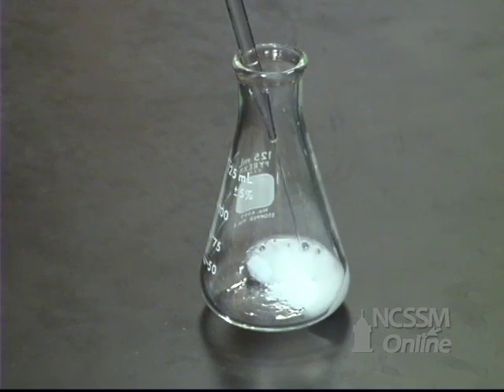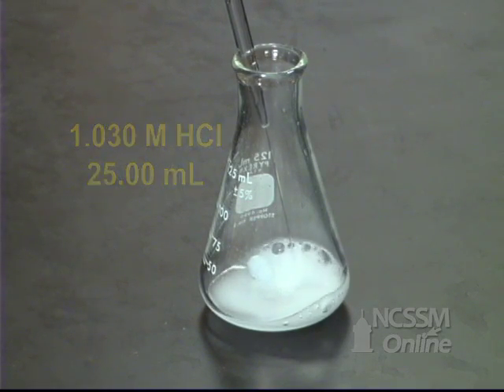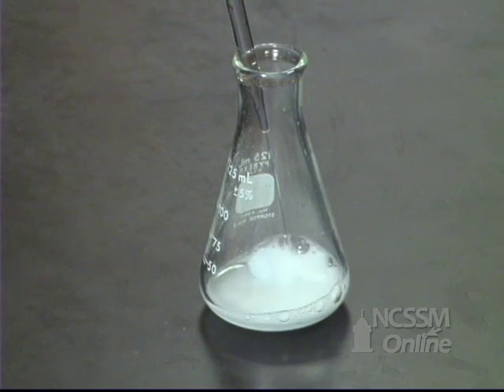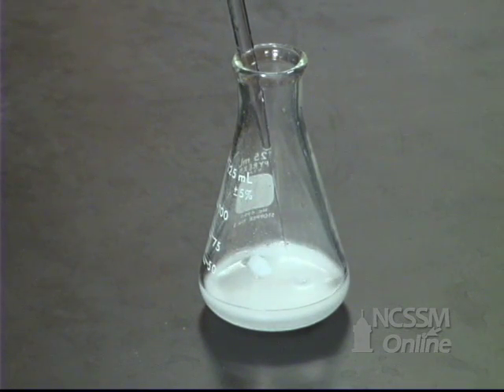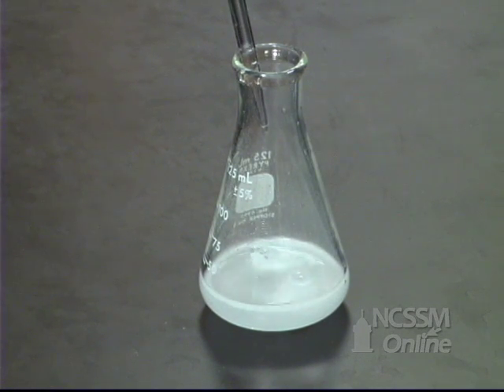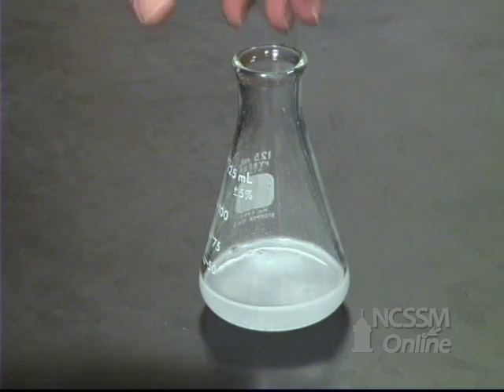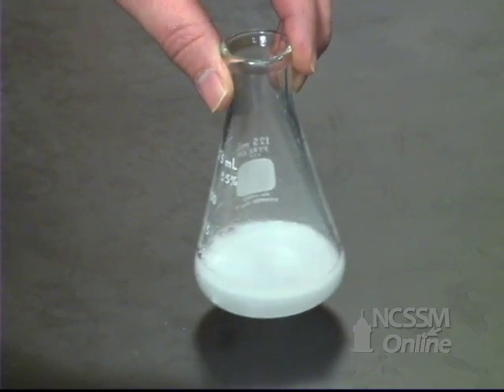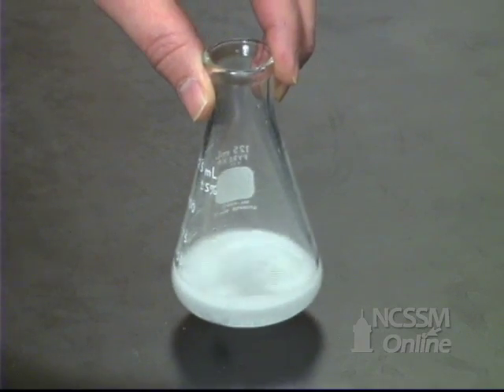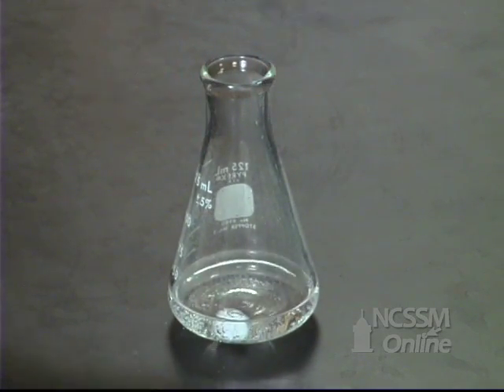The hydrochloric acid reacts with the sodium hydrogen carbonate and sodium carbonate to produce water, carbon dioxide, and sodium chloride. The carbon dioxide escapes from the reaction mixture. There will be an excess of hydrochloric acid at the end of the reaction. We'll gently swirl the reaction mixture to make sure that the sample gets a chance to react. We know the reaction is complete because we no longer see carbon dioxide being emitted.